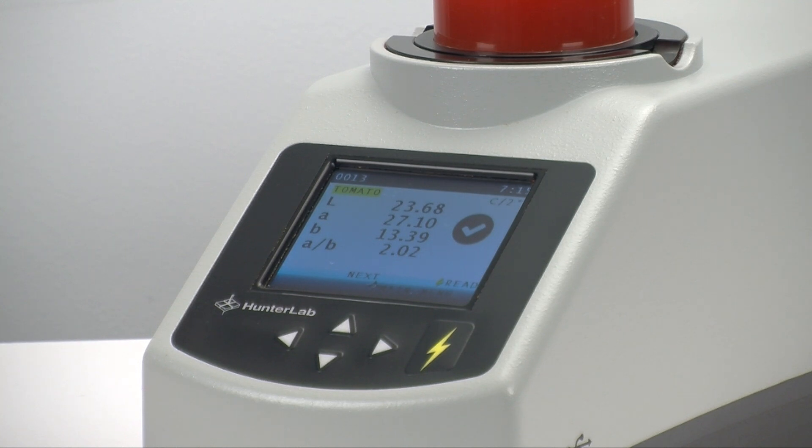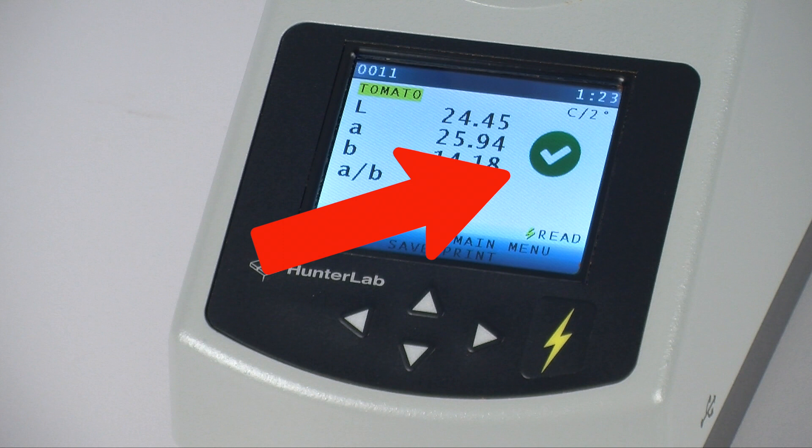Further simplifying the task of evaluating your tomato product is a visual pass or fail mark. It indicates whether that sample is within the established, acceptable color range your company has set for quality product.